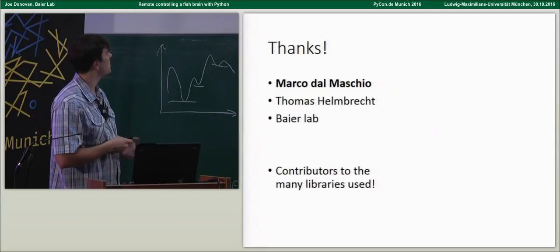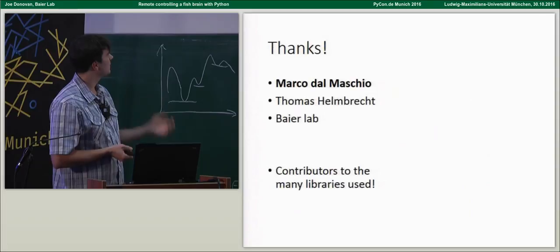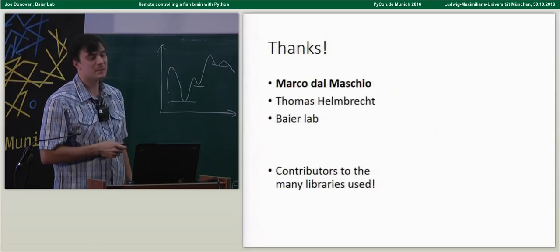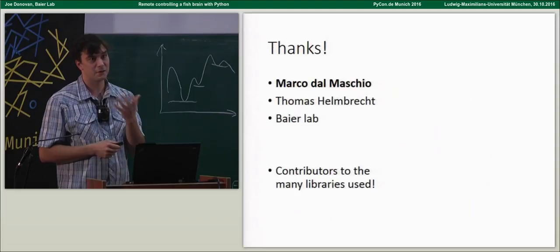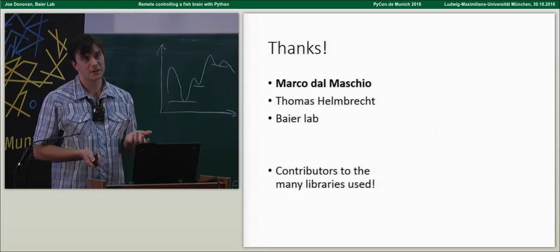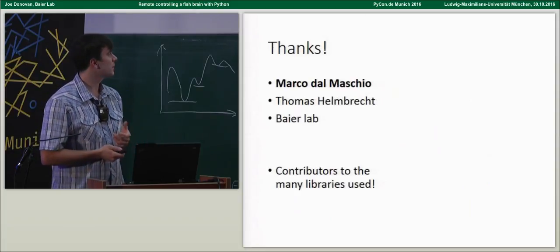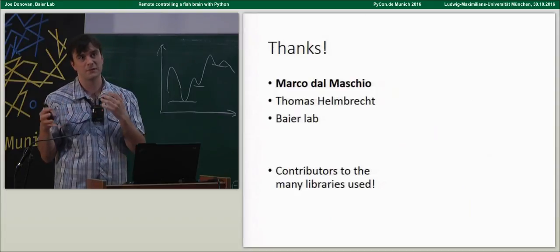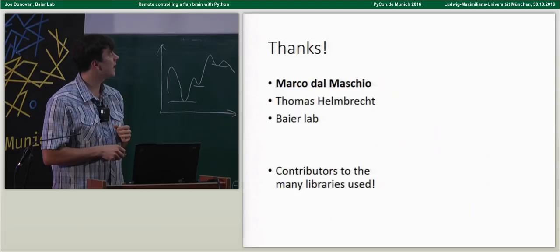All the figures are done in Matplotlib. There's skimage, sklearn, NumPy, Python, of course, SciPy. It's very great because in Python you can just do everything. This is one of the reasons I think it's so great as a science language. We also have a database for the lab to keep track of our fish that runs in Django. Compared to some of the other languages that do one thing like statistics reasonably well, you can't use them for many different things in the lab.